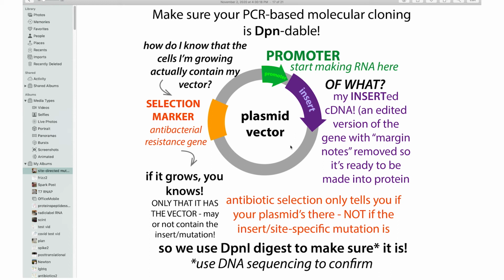But when you're doing this mutagenesis, you're starting from the plasmid that was originally there before you changed it, so both the changed and the unchanged version are going to have this resistance gene. If you just stick it into bacteria, the parent vector, the unchanged version, is still going to have the ability to grow, and it's going to have a growth advantage because it doesn't have to be healed.